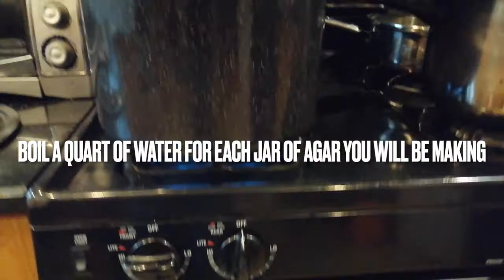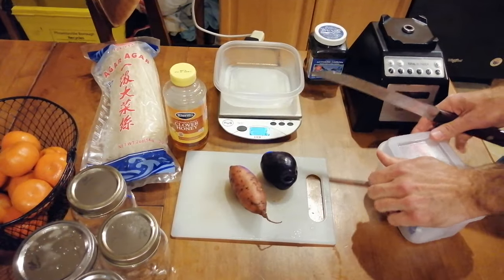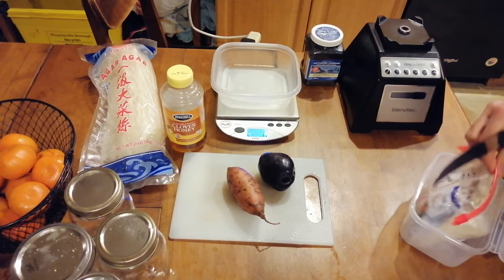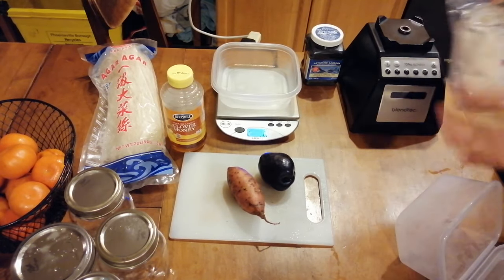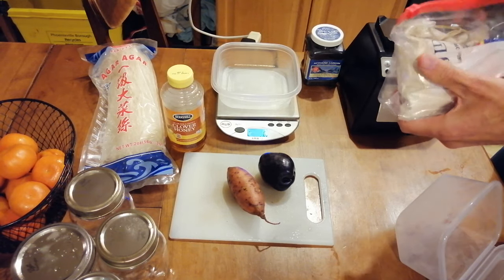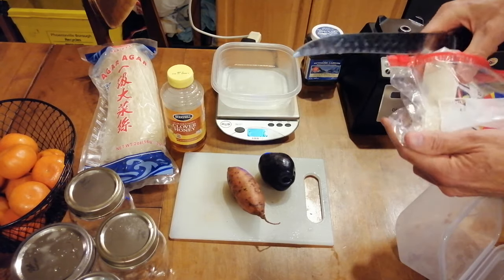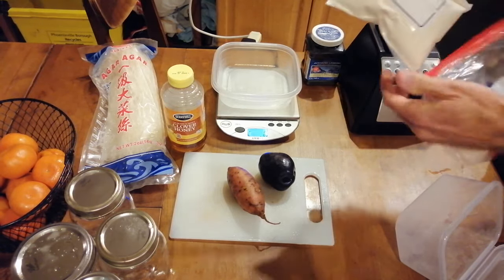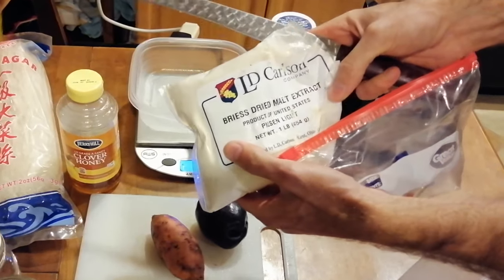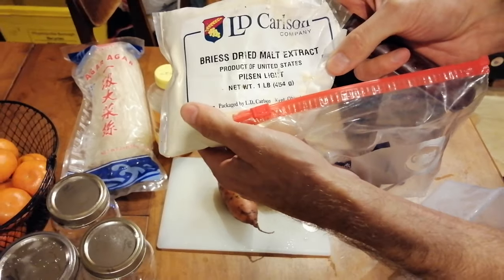Boil a quart of water for each jar of agar you will be making. Gather all of the materials you'll be using for whichever type of agar you decide to make. The most common type of agar used for mycology and the version I recommend is light malt extract agar, or LMEA, sometimes just called MEA. The recommended malt extract is very inexpensive and can produce hundreds of plates worth of agar.